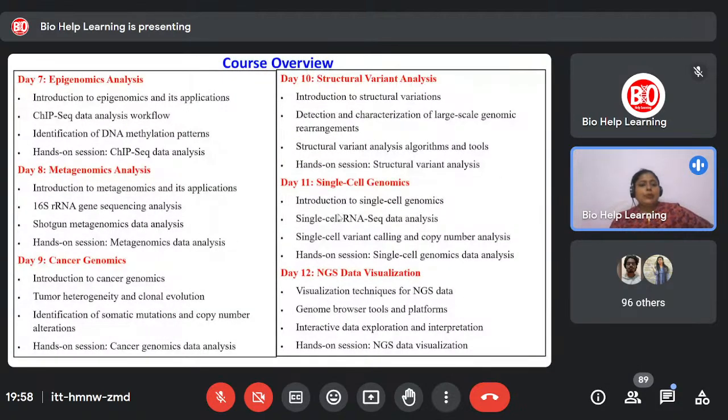Seventh day session is the epigenomics analysis, where you can understand epigenomics data identification, which is useful for the identification of DNA methylation. There is a hands-on session on that. Then metagenomic analysis, which is useful for understanding environmental biodiversity. We will also have a hands-on session on metagenomic analysis.